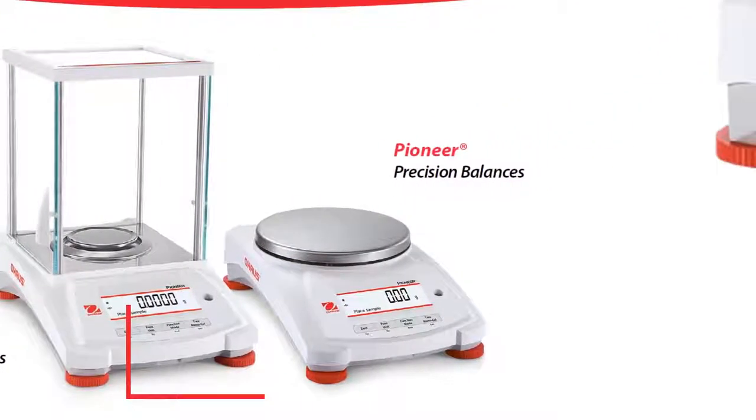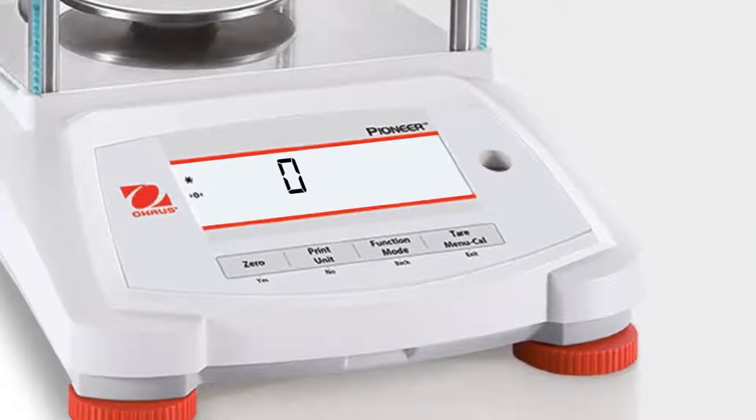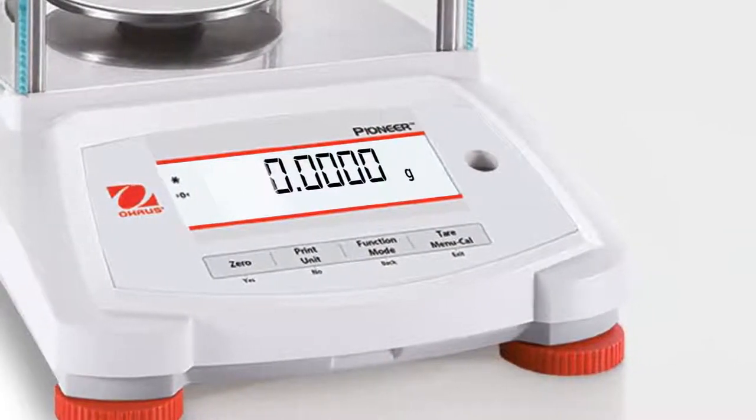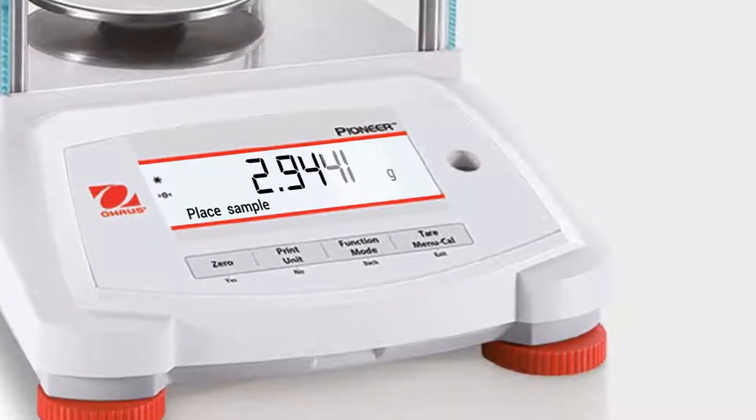Let's take a closer look. A brightly lit dual-line display shows the weight in an easy-to-read manner, while a dot matrix second line provides additional information or guidance prompts to the user.